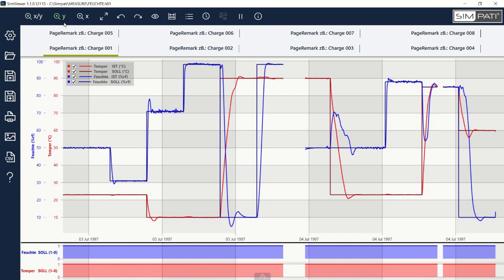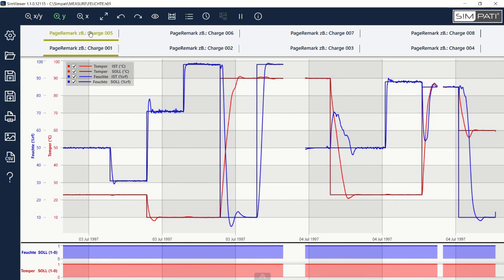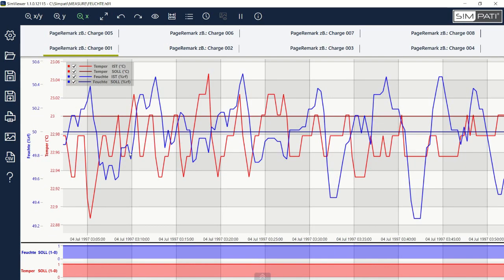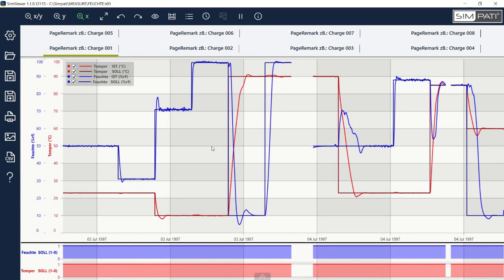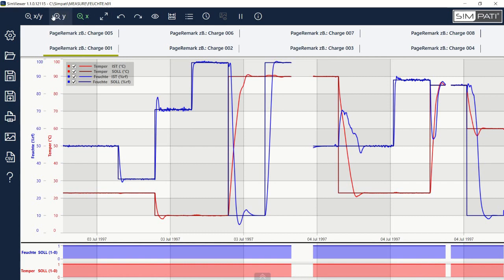If you're interested in just the Y dimension, you can click and drag for that zoom, Control Z to go back, or for your X dimension, same thing, and the scales adjust. Now this is a little bit hard to read. Control L will also take you to a full view of your data, so that's a quick hotkey that's helpful. Here, complete view. So if we zoom here, that'll take you to a complete view again.